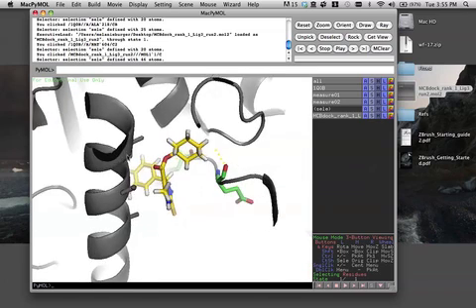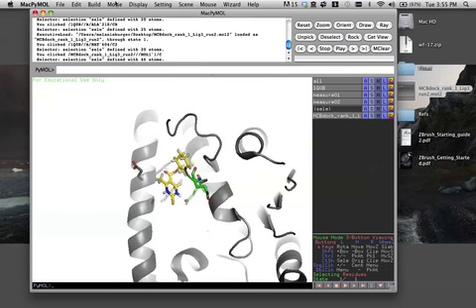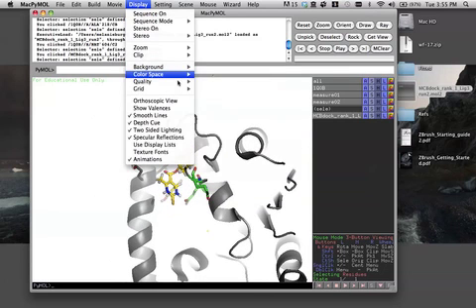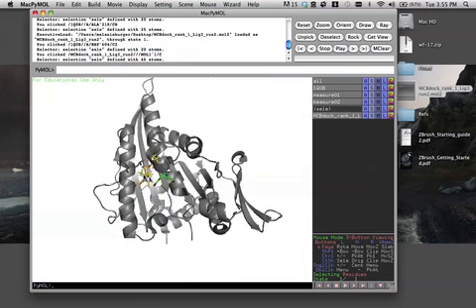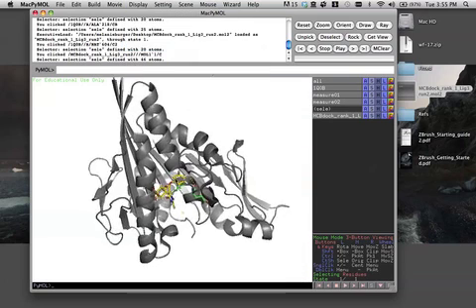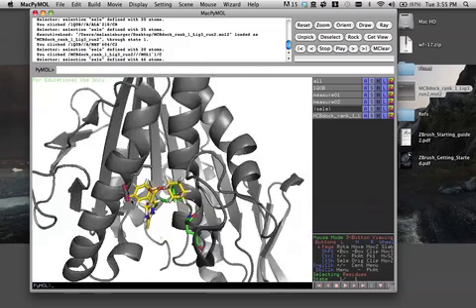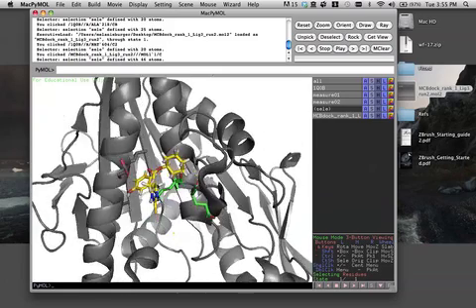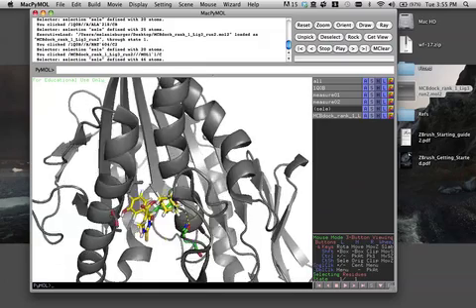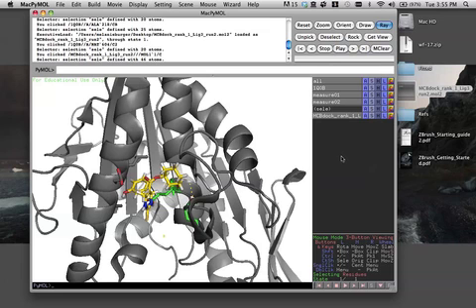Now, for the purpose of the wiki, we want to create a nice picture of this molecule. So I'm going to zoom out. Actually, what I'll do is go zoom all to get the full protein. And then I'll zoom back in to my docked ligand MCB1. Put it in sort of a nice position, and then click on Ray.